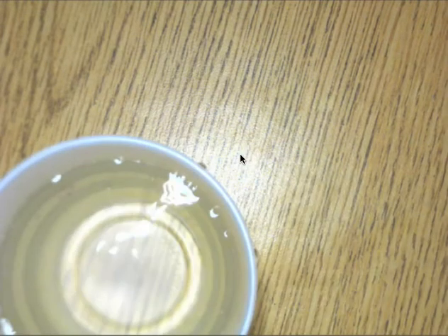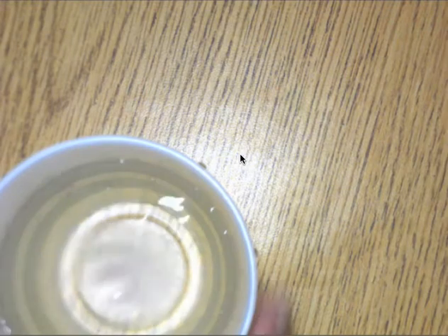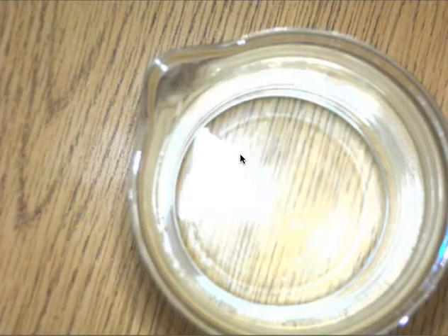Next, let's start this lab here. So first part here, it says put your goggles on. We're going to add water to a cup. So we have our cup of water right here. It says soak dialysis tubing in water. So I don't have a sink right next to me, so we're going to use this beaker of water.